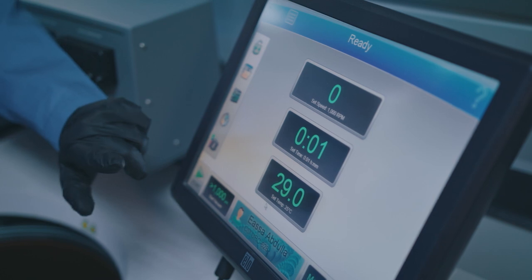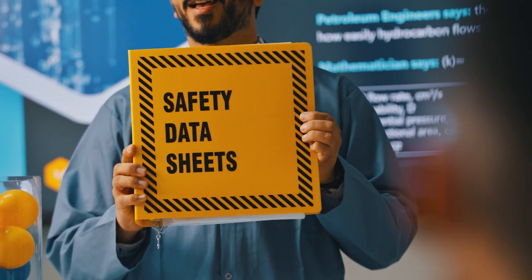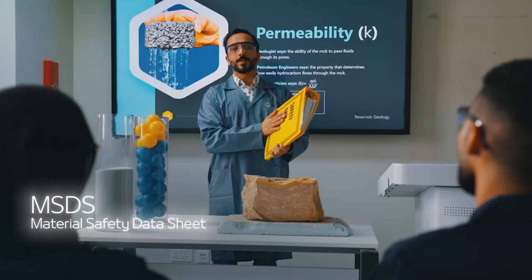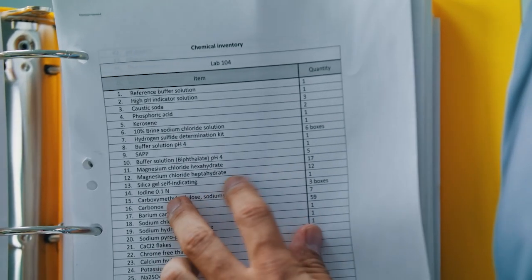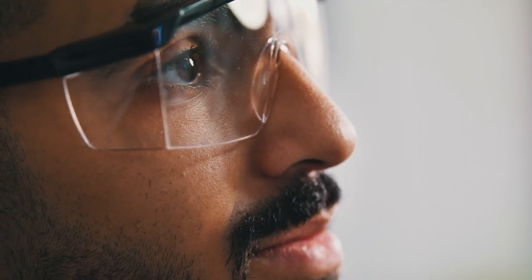The instructor is the first port of call for all problems and questions, and the instructor's instructions must be followed at all times. Before work in the laboratory can begin, the laboratory instructor demonstrates the techniques and laboratory equipment to be utilized. Furthermore, the instructor will discuss the Material Safety Data Sheet, MSDS, that conveys information about the associated hazards of chemicals. The instructor will also ensure that the MSDS is up to date and accessible to students at all times.